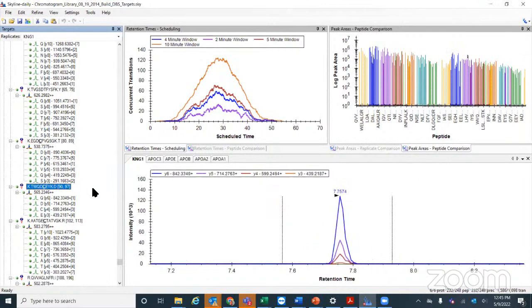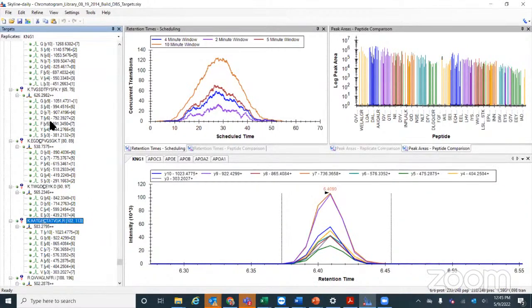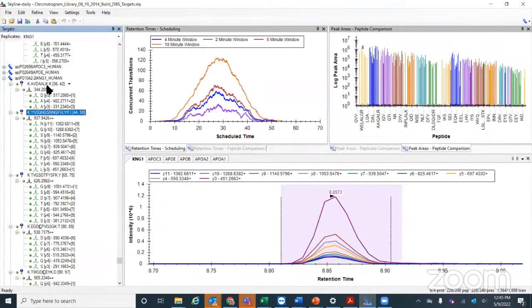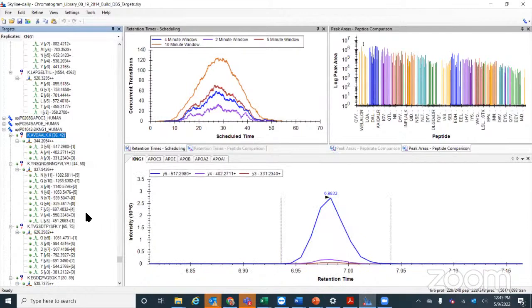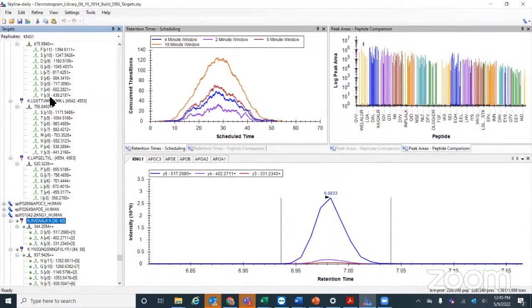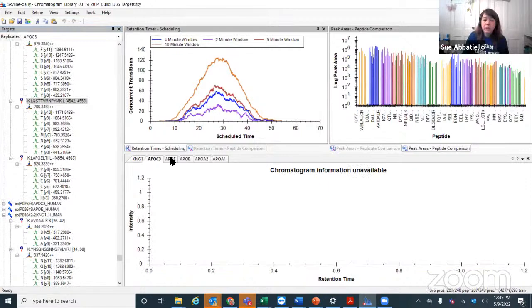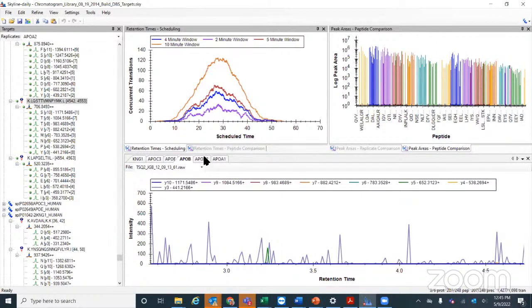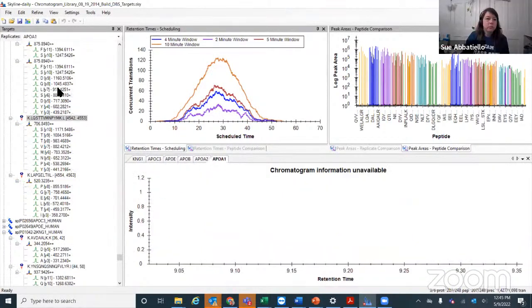Yep, understood. So in the scenario where you're talking about a proline next to a lysine or an arginine, would that be addressed if you were to set the exclusionary criteria that you don't have any miscleavages? It could, depending on if it generates a miscleavage or not. Usually the KP or RP would be the sequence where the proline is after the lysine cleavage point, and that would be a miscleavage product. Not if it's before the lysine or arginine. Right.